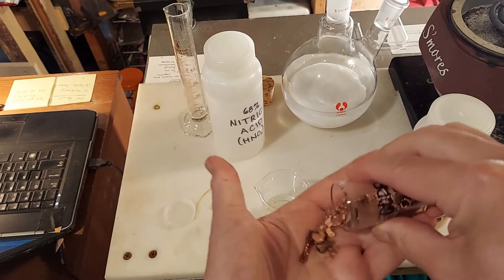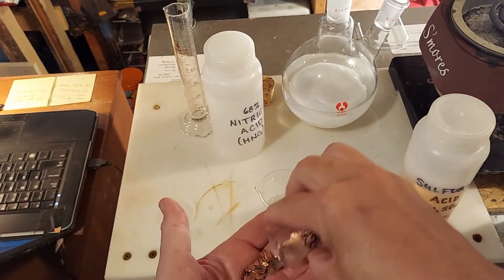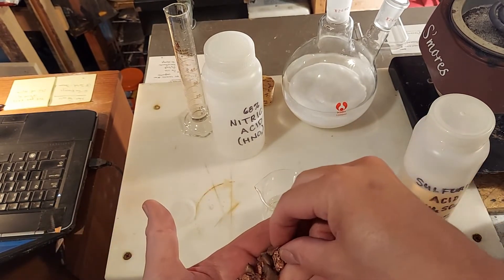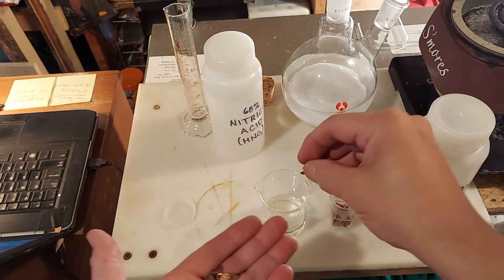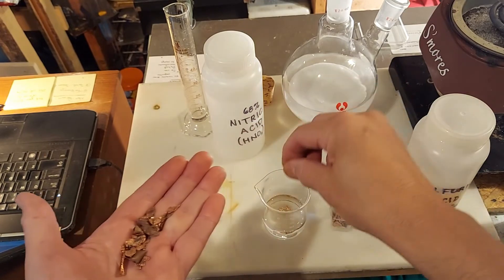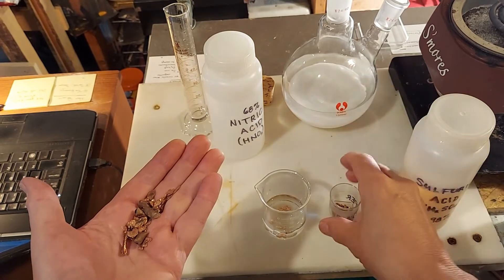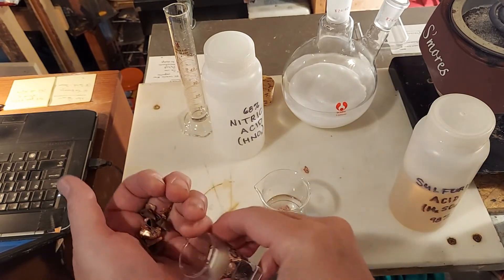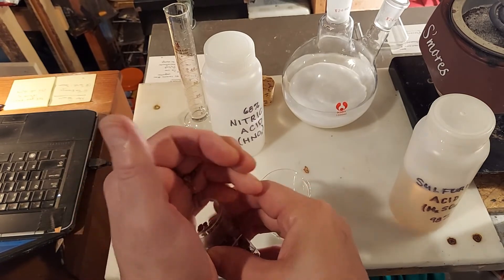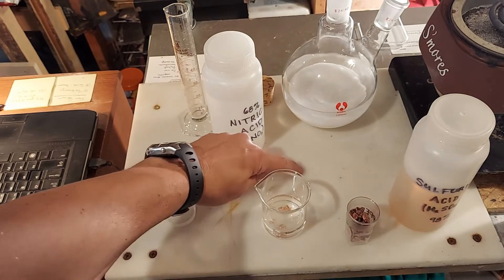Here's just little bits and pieces of copper chunks — and copper piping actually in the bottom; I cut some pieces out. We're going to just put a few of these flakes here and there.